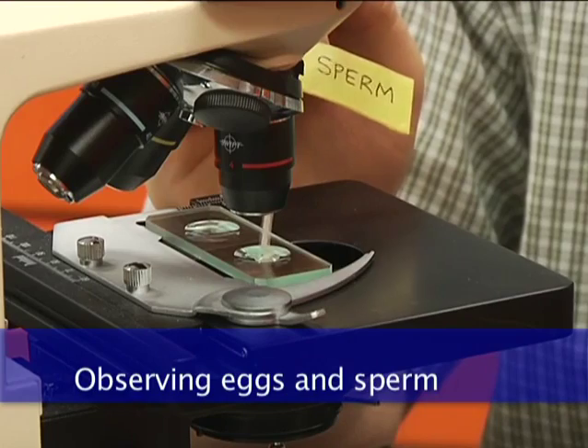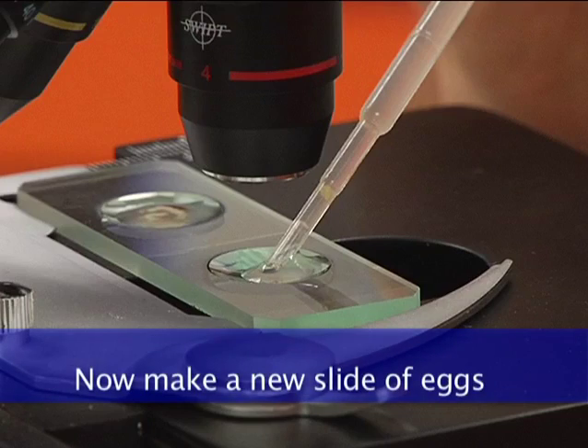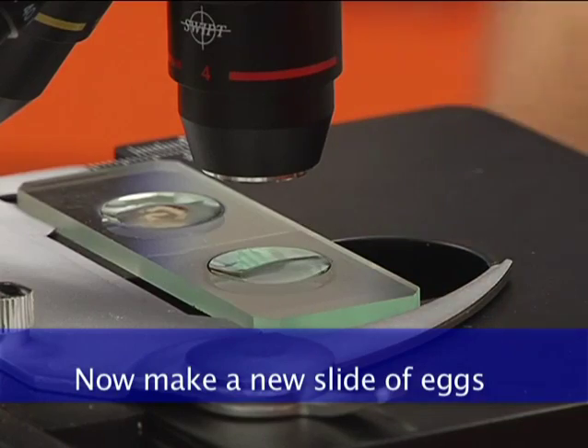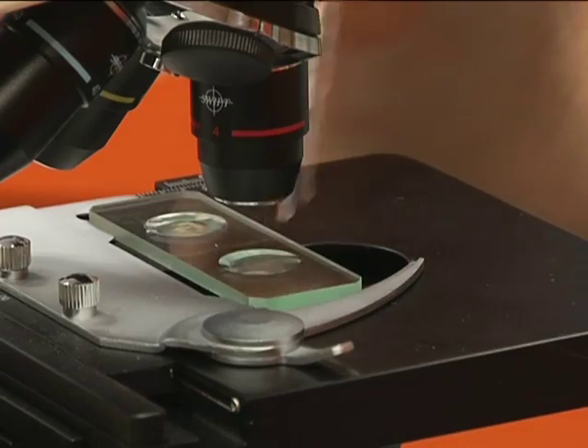Place a drop of sperm on a depression slide and observe it under low power, medium, and high power. Repeat this with a drop of unfertilized eggs. Now fertilize the eggs with a drop of the sperm solution.